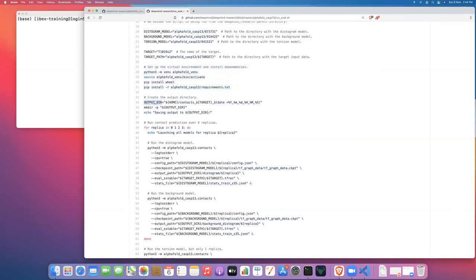We don't want to write the outputs of this job to our home directory, which is the default setting they have. We want to write the outputs inside the project directory itself where we're running — in this case, inside our AlphaFold CASP13 folder. It doesn't make sense to write these output files to some place in your home directory. It's much better to keep them inside a results directory we'll create inside the AlphaFold CASP13 folder.